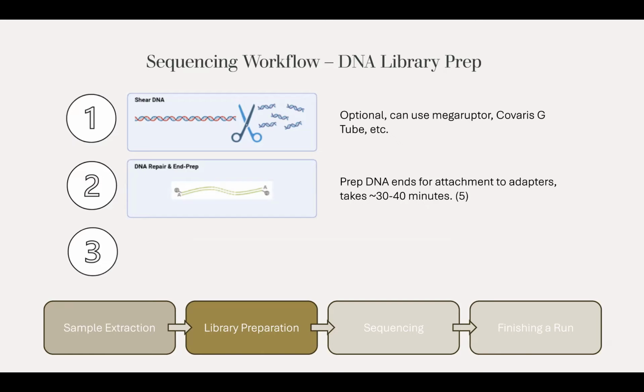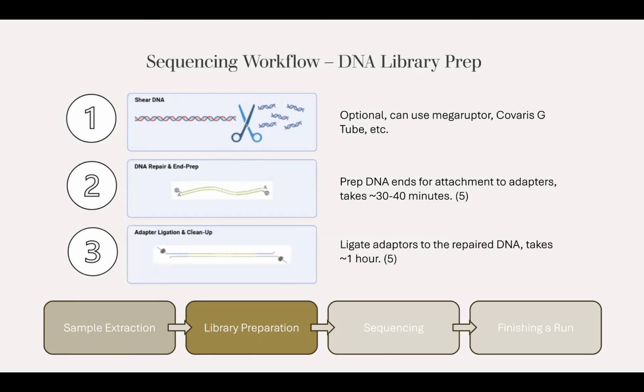But the broad picture for this step is you prepare the DNA ends for the attachment to the adapters, which I mentioned earlier on in this presentation, for ligation to the motor proteins, which is the third step. So the ligation of the adapters to the repaired DNA, and then cleaning up all of the shorter fragments that might be left over in your library.